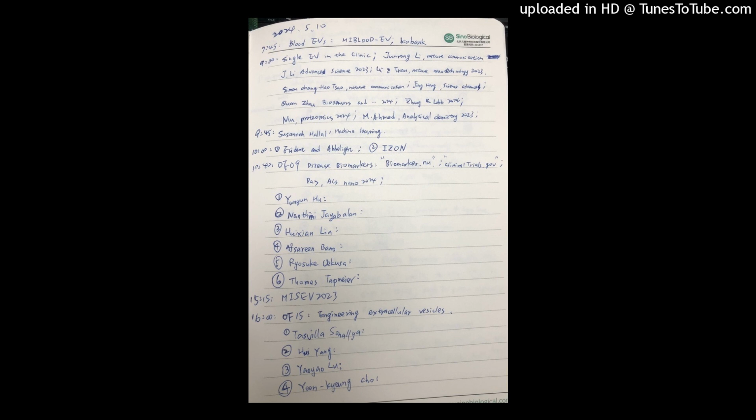So we've come up with a very, very simple strategy. It's applied to mouse, human samples, but basically it's to do with density. And yes, there are very, very good size exclusion protocols as well, but you need much greater volume, all right? So we've kind of standardized as best as we can. But the key thing is basically how consistent is a healthy cohort sample, all right? So making sure that that primary variation is really, really tight, because unless you control that, you can't really take the next steps to look at whether it's a cohort variance or a disease variance.